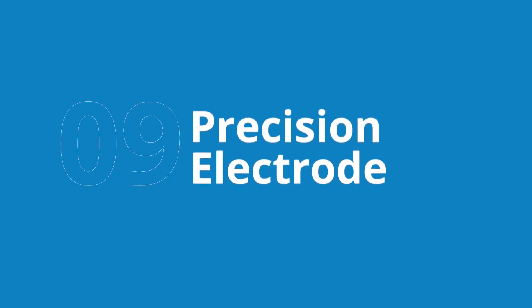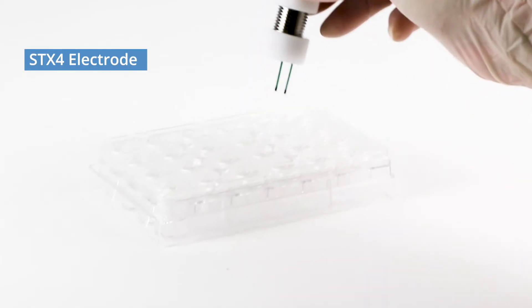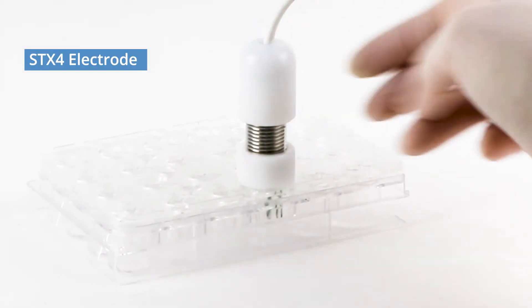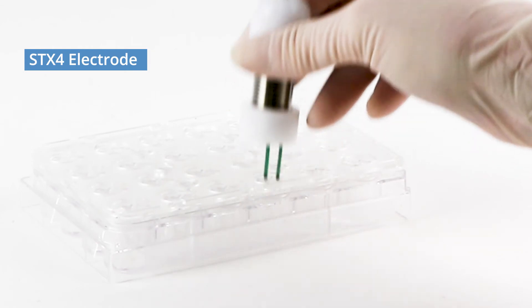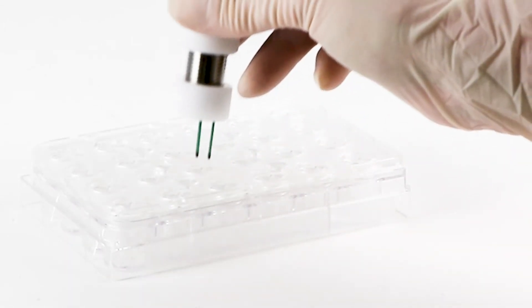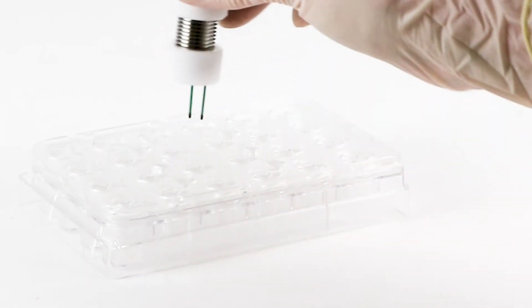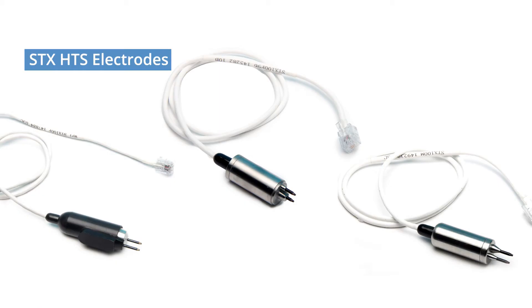Finally, the STX-4 electrode ensures consistent measurements with less fluid required than previous models. Older electrodes require a steady hand, but the STX-4 fits perfectly into the cell culture well, so you get the same placement, at the same depth, every time. You can choose the electrode based on your application. The STX-HTS electrodes are suitable for high-throughput screening plates.